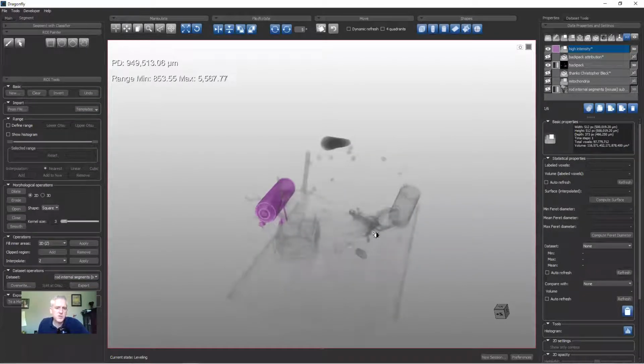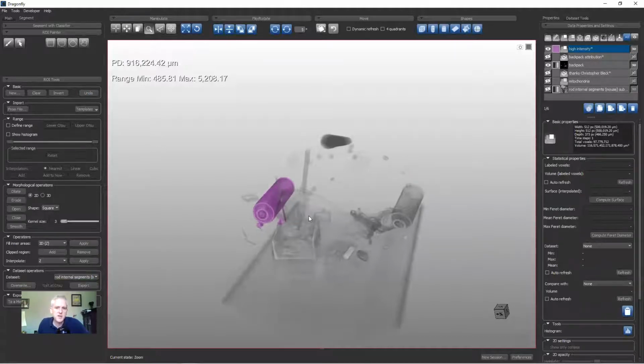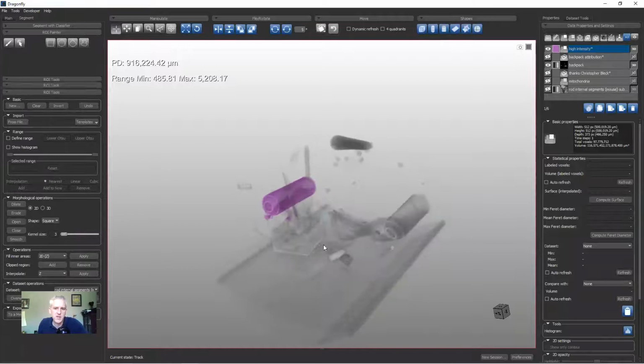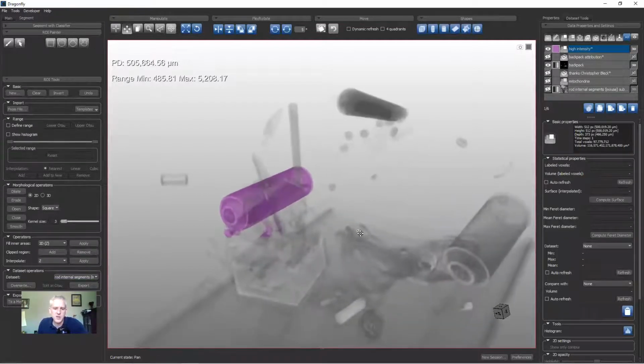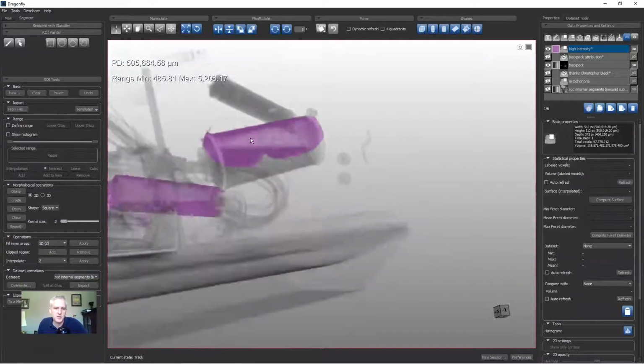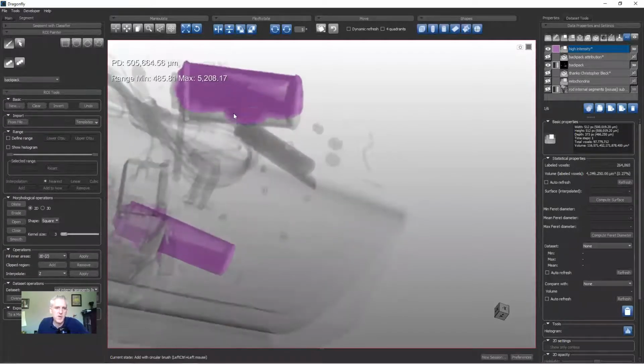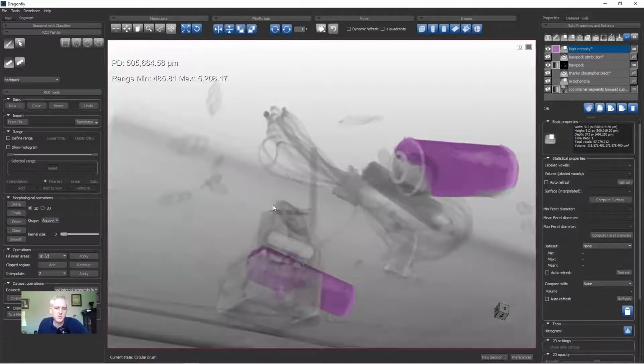Now that I've reduced the contrast, if I put my cursor in exactly the same spot and I paint, it's only going to paint if I'm intersecting some pixels that are not transparent. This means that if I wanted to paint this can, for example, I could zoom in and just start dragging and painting. And I can use the track mode. I hold down T to rotate. So you can paint or you can erase with Control and Shift, just as before.